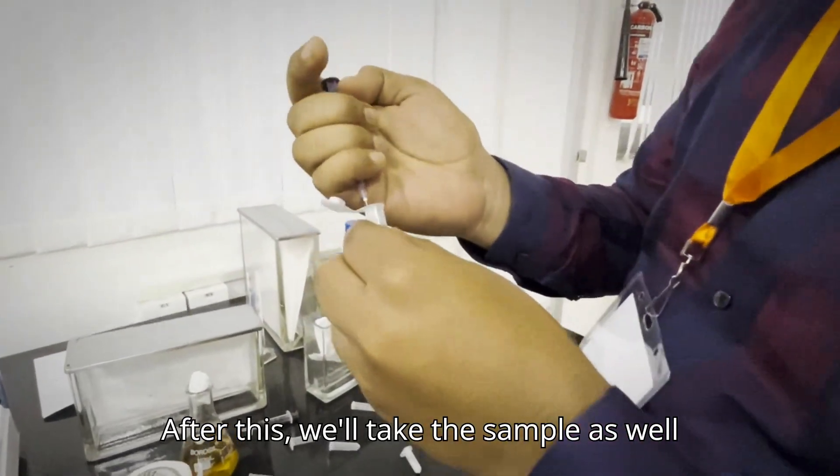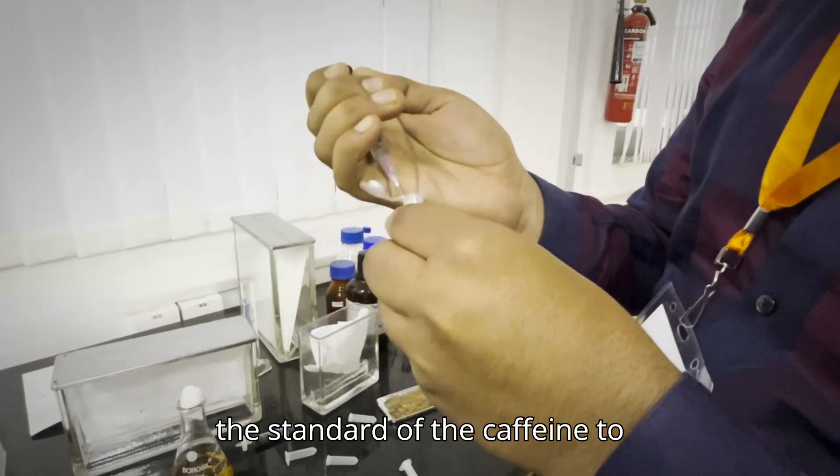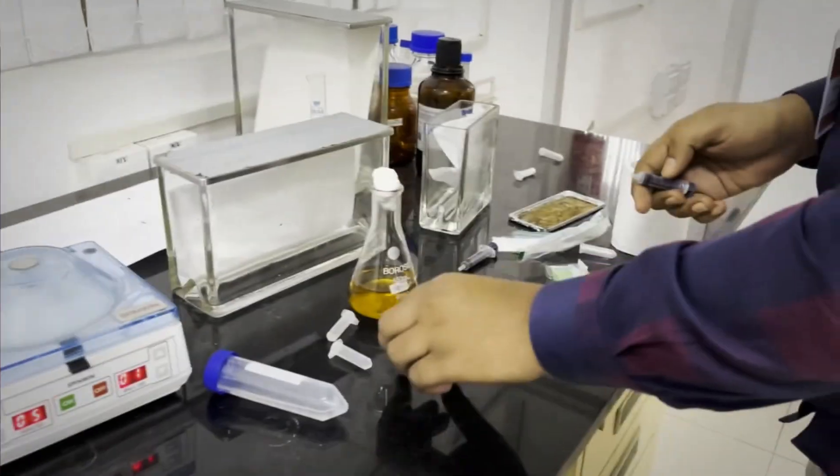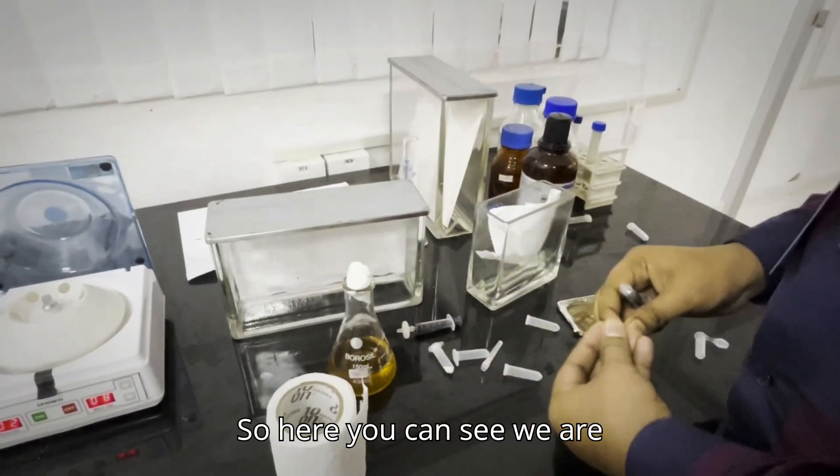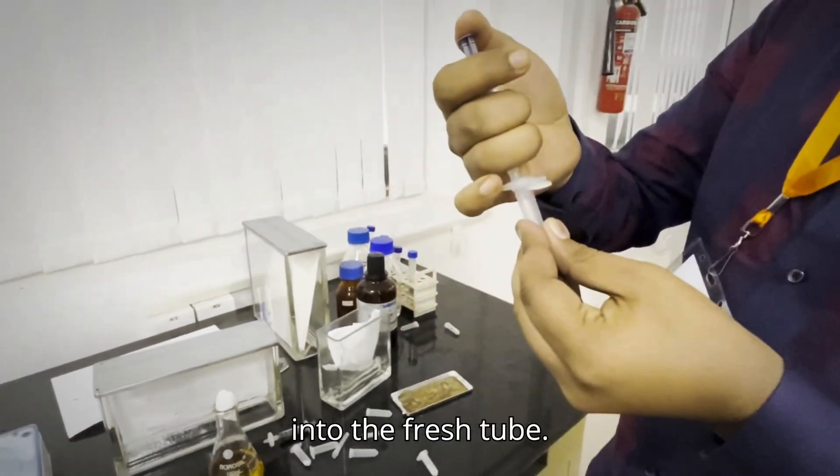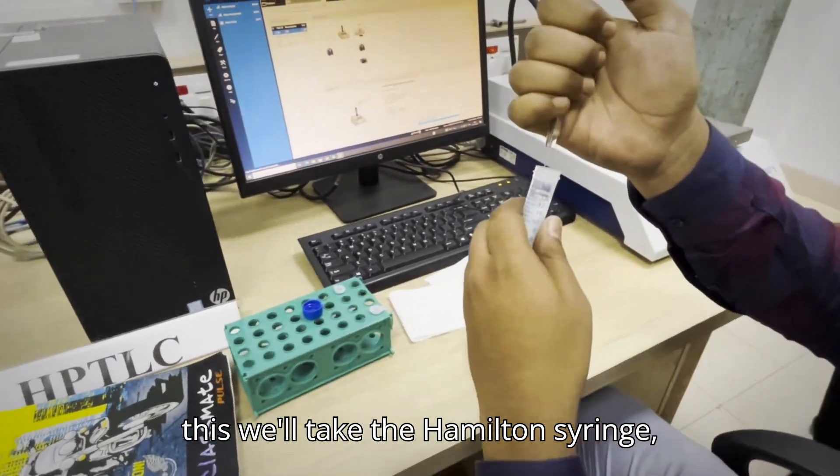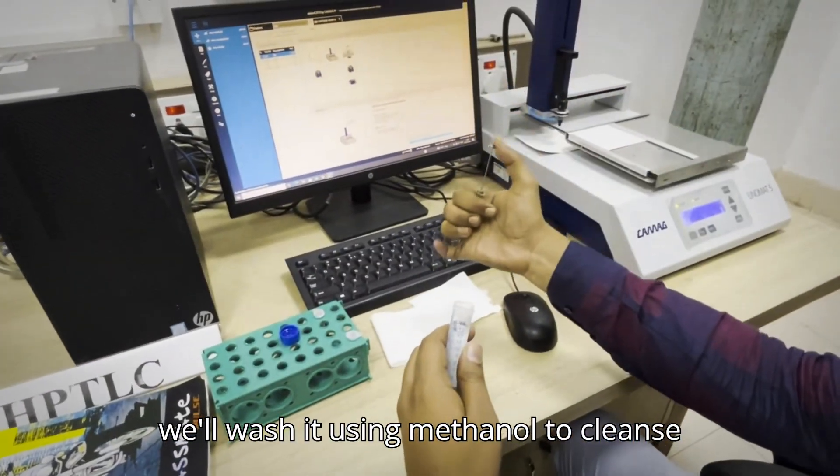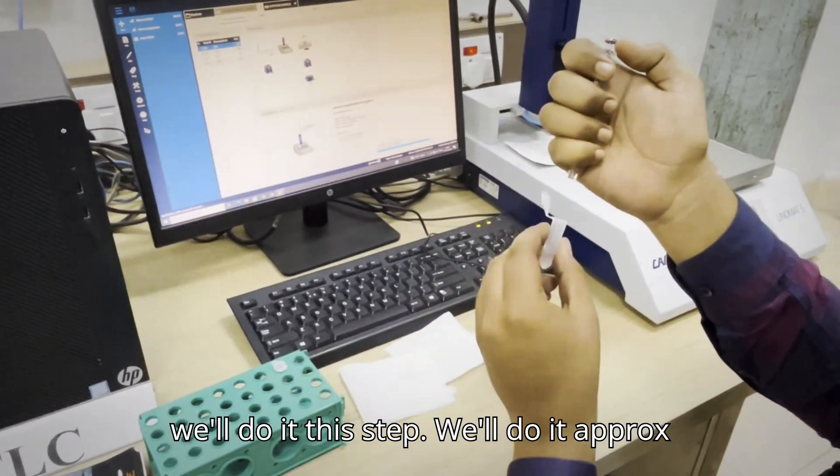After this we will take the sample as well as the standard of the caffeine to filter it. Here you can see we are filtering the caffeine sample into the fresh tube. After this we will take the Hamilton syringe. We will wash it using methanol to cleanse the entire particles which is present inside it. And we will do this step approximately three times.